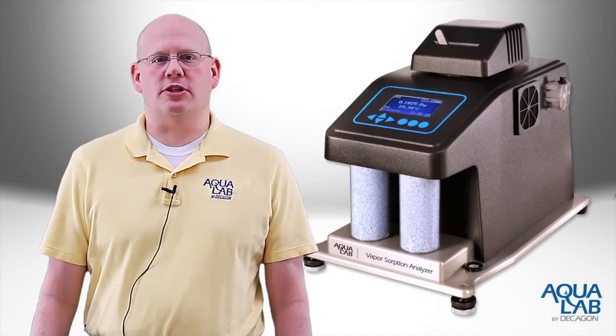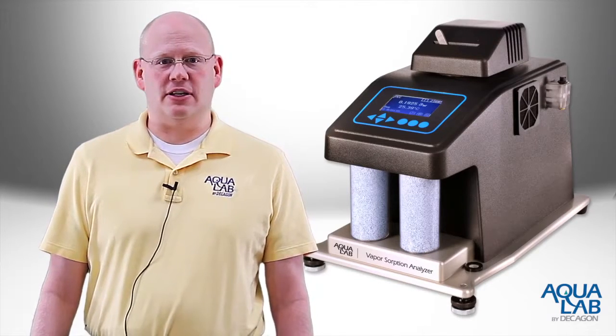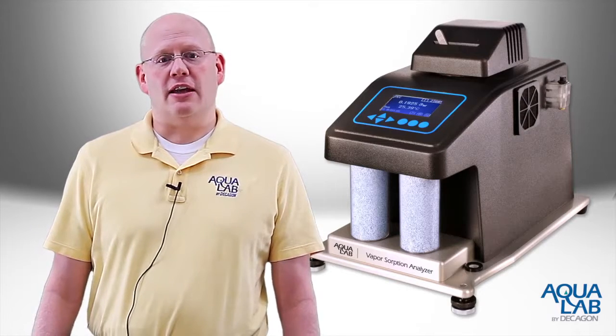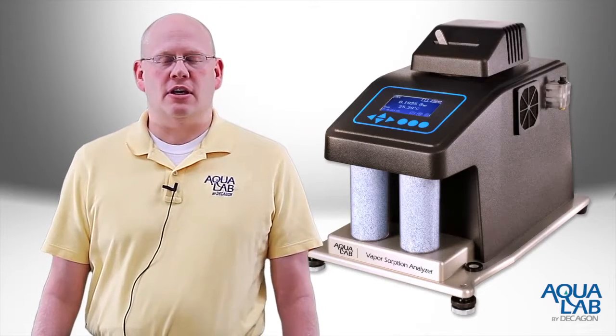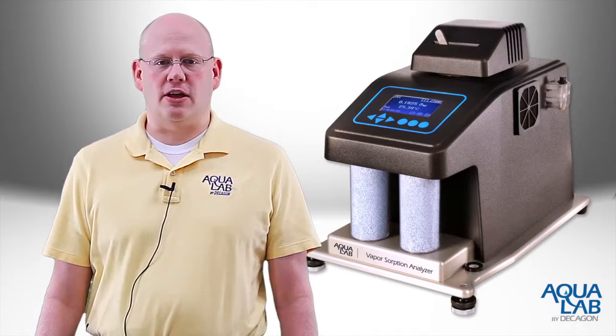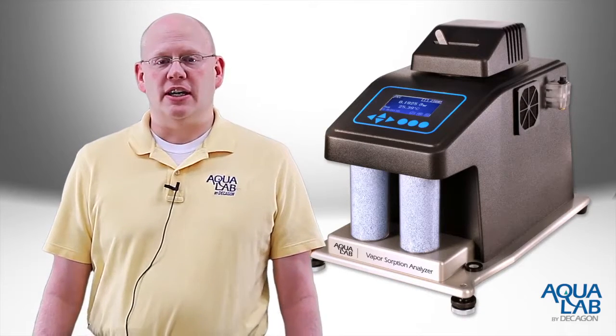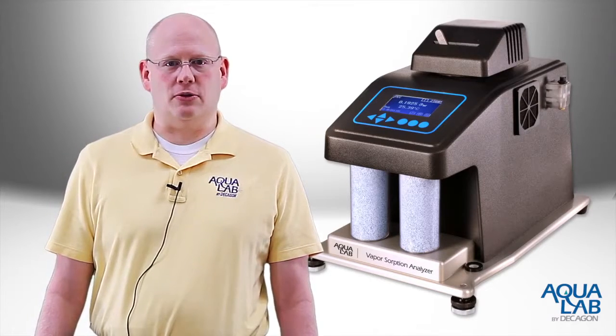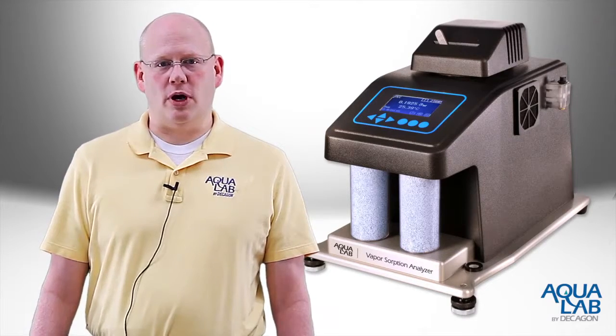The Aqualab vapor sorption analyzer from Decagon devices is a new low-cost moisture sorption analyzer that uses a large sample size, does not require any external gas, and is the least expensive sorption analyzer on the market. In addition, it has the added advantage of being able to do both dynamic isotherms and static isotherms in one instrument.